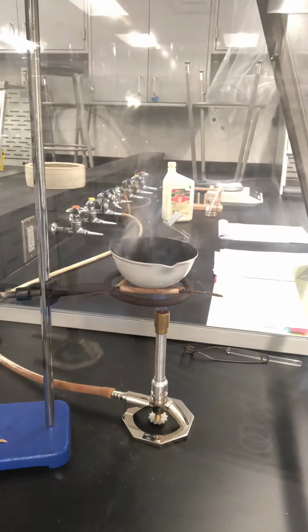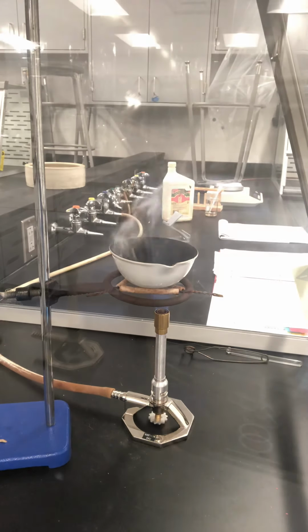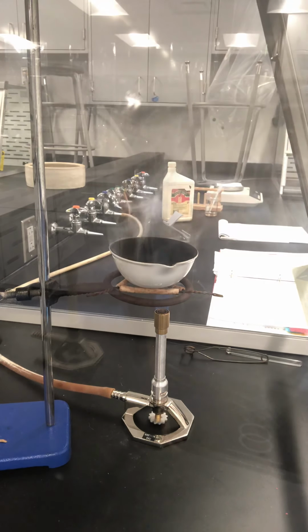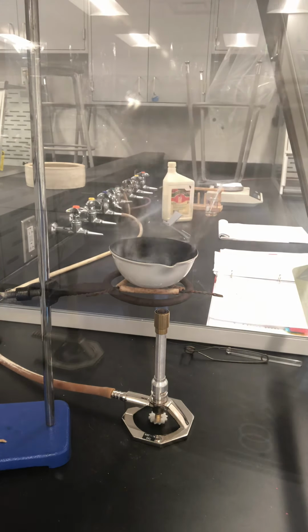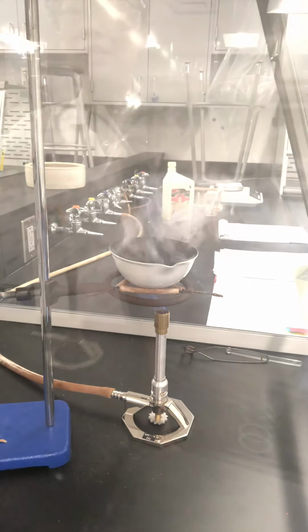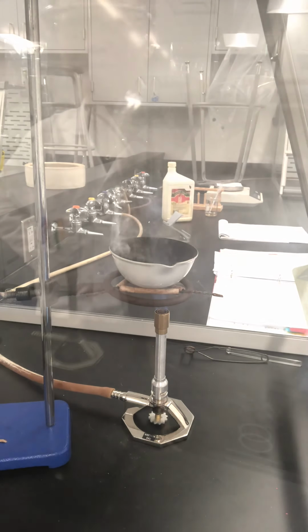And now you can see the white fume come out. Sulfur trioxide. If there is moisture, it will turn into sulfuric acid.